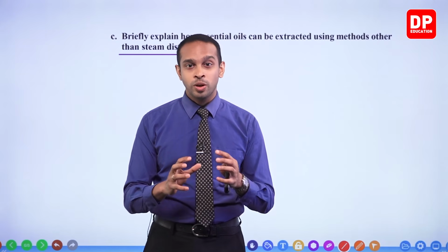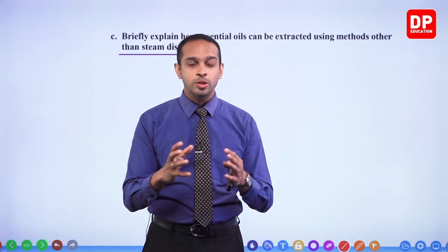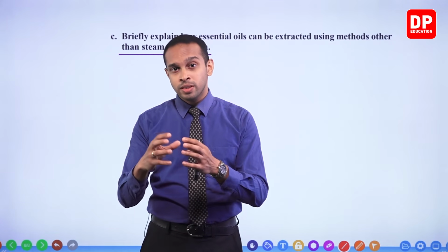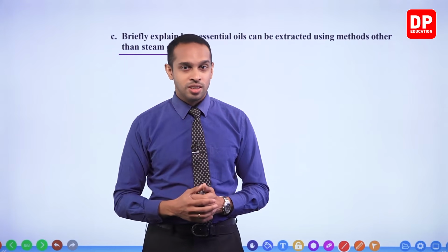So in this process, we are not subjecting anything to a lot of heat because essential oils extracted this way happen to be a bit volatile. So after the removal of the solvent, we are left with just the essential oil.